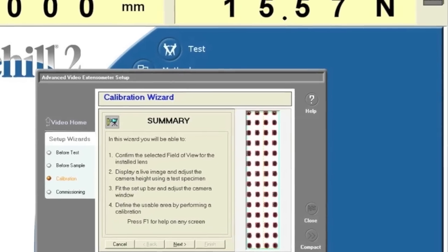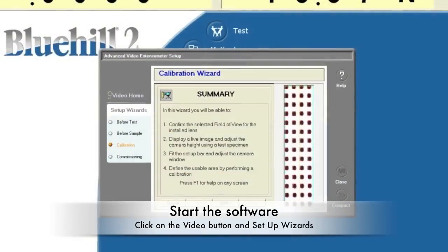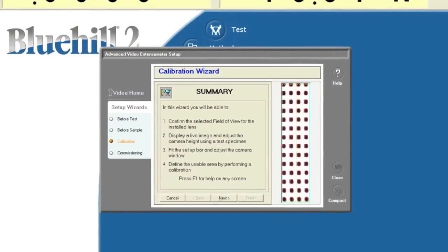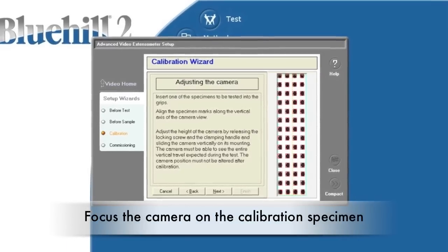Next, open the BlueHill software and click on the video button in the top right corner. Then click on the setup wizards and calibration. Follow the prompts on the screen. First, confirm the correct field of view. Adjust the camera to focus on the calibration specimen.